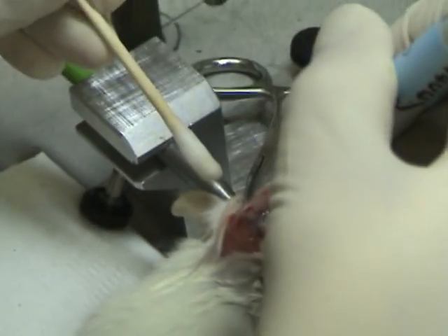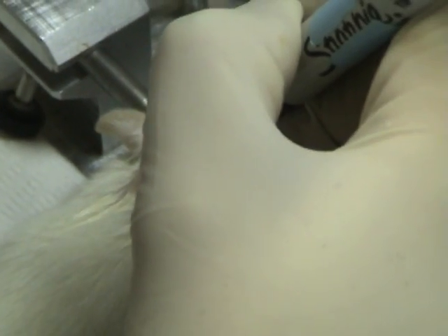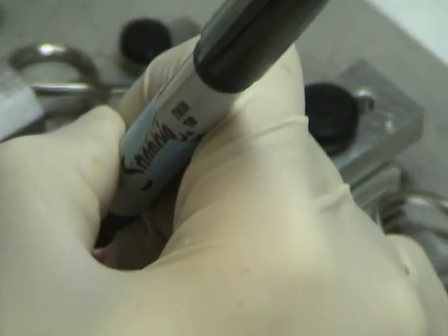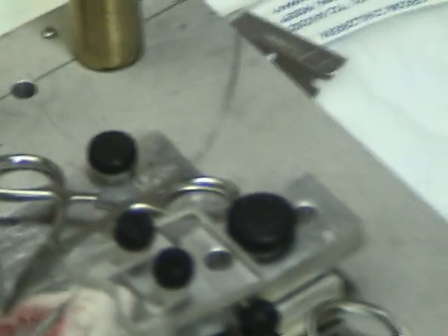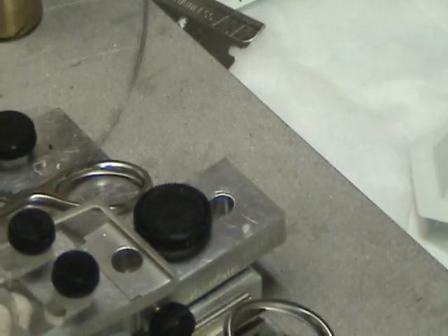Just put this break mark here. I'm going to make a hole in the skull without any damage on the cortex, on the brain.